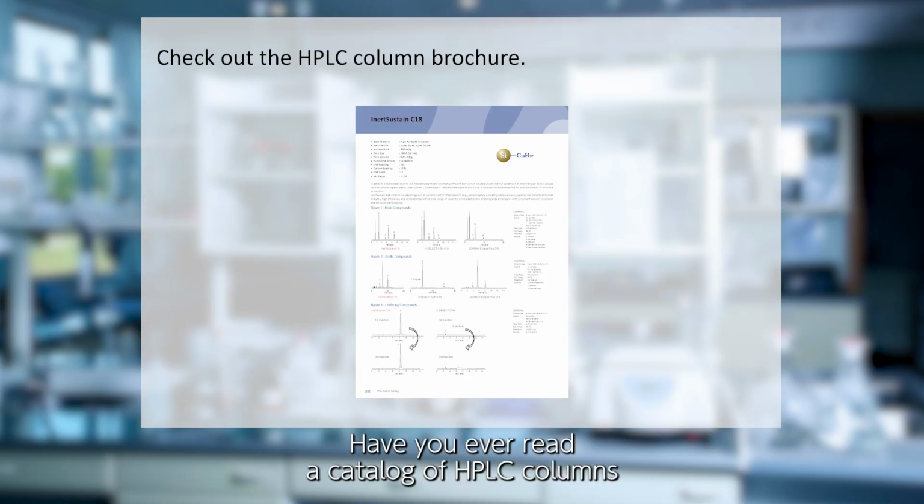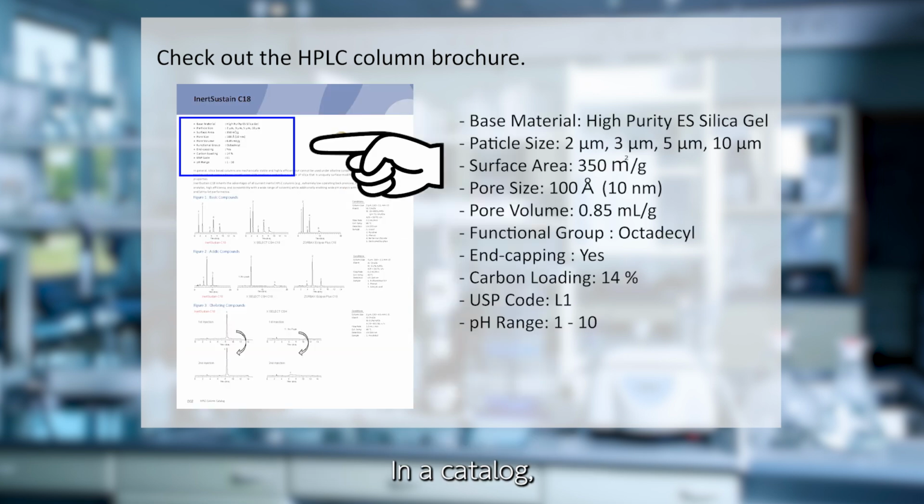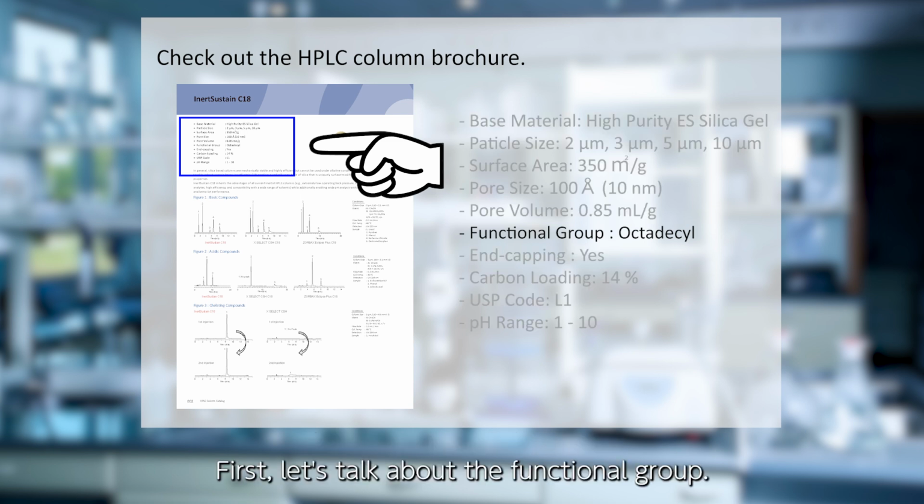Have you ever read a catalog of HPLC columns? In a catalog, there is various information about packing materials. First, let's talk about the functional group.